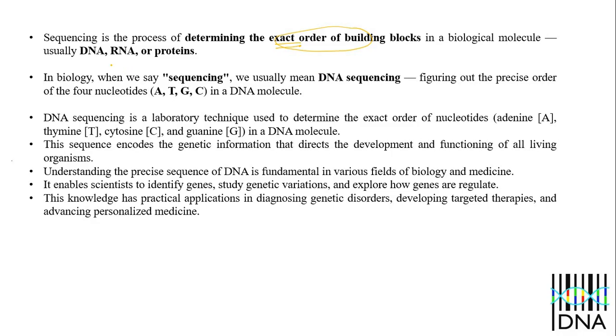These biological molecules may be DNA, RNA, or protein. The building block of protein is amino acid. Whenever we find out the exact order of amino acids, this sequencing technique is known as protein sequencing.